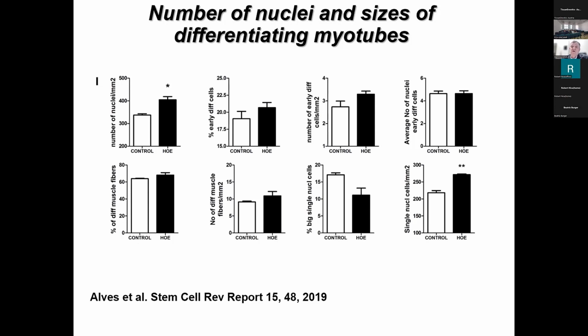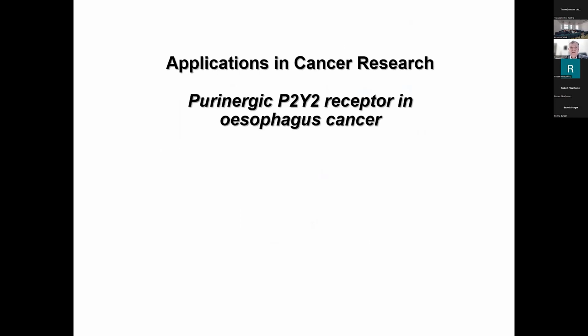So we can do a lot of analysis altogether. And we can also measure the size of the cells that we have and all this type of stuff. And further on, what we can do also using this technology is applications in cancer research.